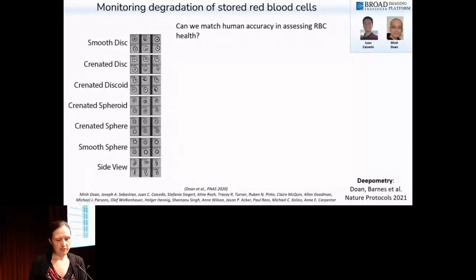And so historically, researchers in this area would notice that the cells follow this progression shown here, and they categorize the cells into 7 categories, and then an expert stares at the cells and sorts them and counts up a morphology index that's based on what fraction of the cells are in each of these different categories. Super tedious, and so anybody who's done any machine learning would say, hey, why don't we automate that? It seems like that's something computer vision can do, and it's absolutely the case.